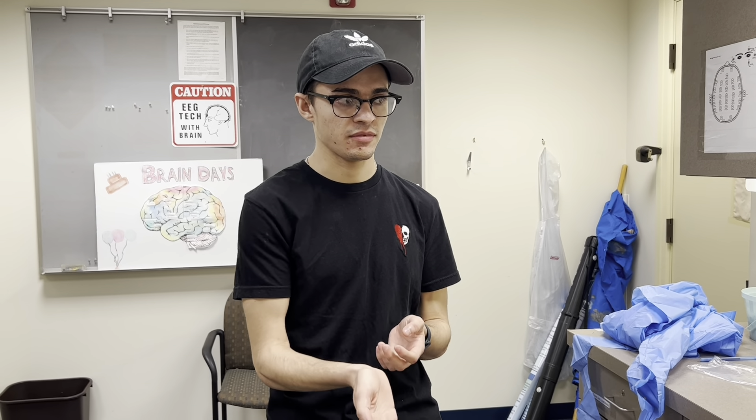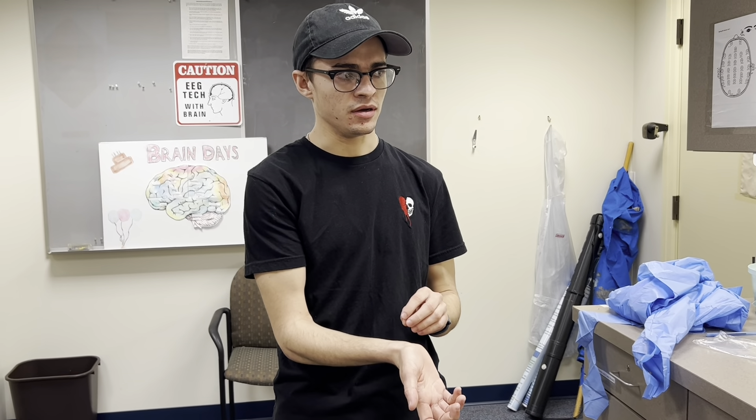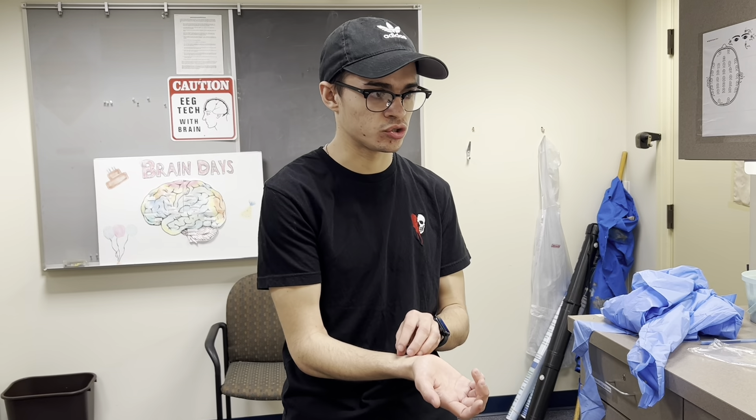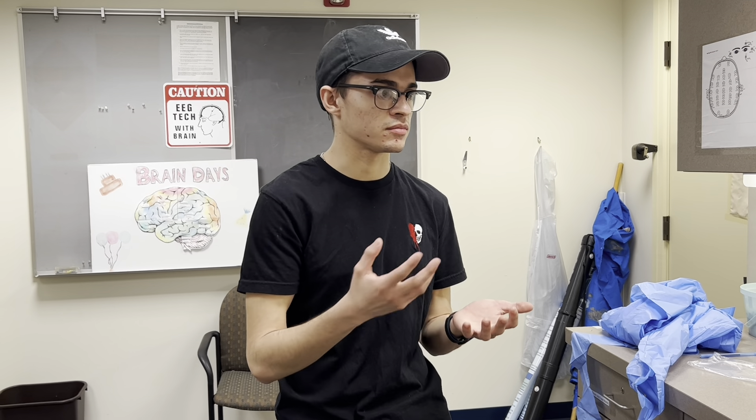From experience, I've had a fabric bracelet get gel in it during a lab session and it was really difficult to get off. It dried and was just very difficult to remove. For rings, similar to bracelets, you can get them gunked up with the gel. It is easy to wash off, but if it's a soft material you most likely don't want to get water on it too often, especially if you wear it every day. Taking it off of course alleviates that worry, and you don't have to risk getting it dirty.